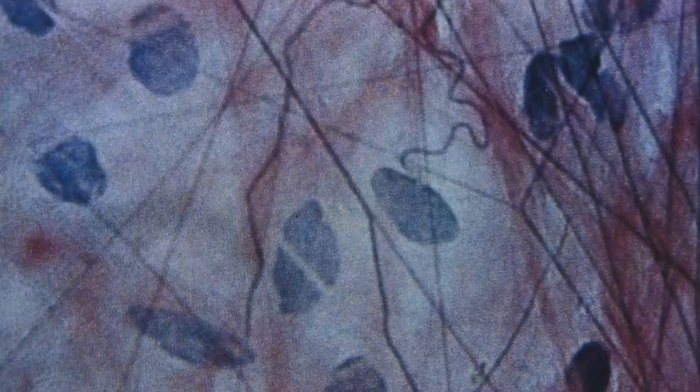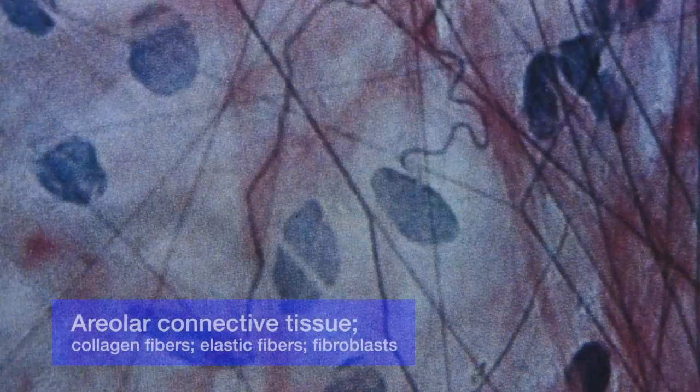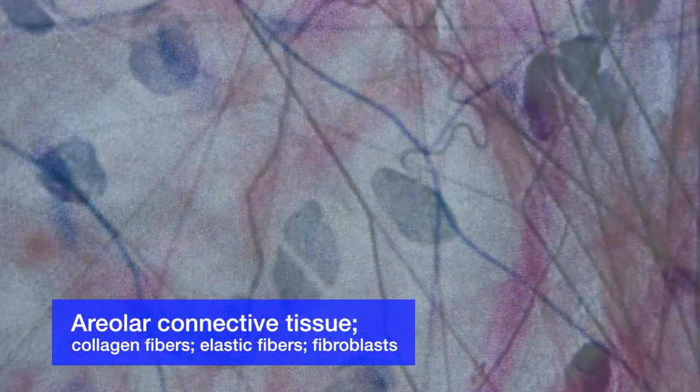So on this slide, you see the blue oval dots. They are fibroblasts, and the sharp strings are elastic fibers, and the bundles in pink are collagen fibers. So again, for areolar connective tissue, please look for collagen fibers, elastic fibers, and fibroblasts.